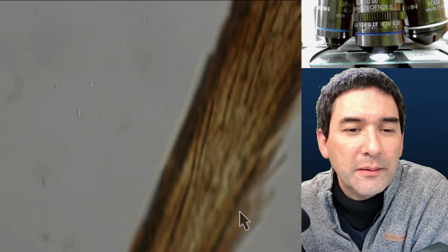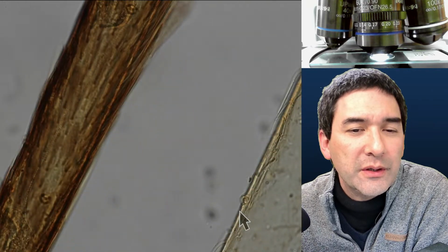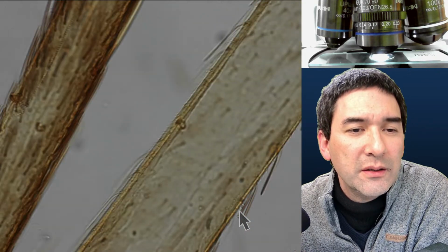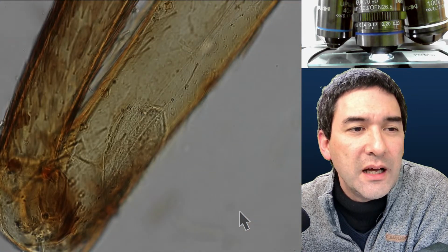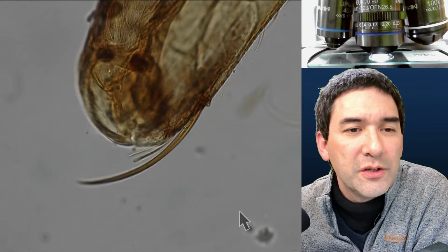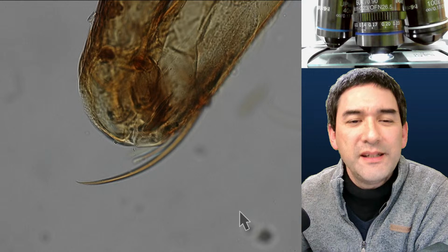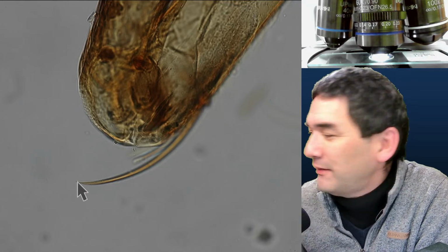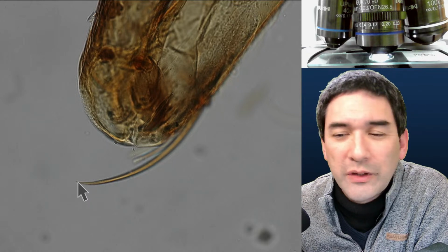And you know what? I think I do have to show you. I've also got some other slides as well, maybe one of my favorite ones. Here, look at this. Maybe here is also a spike, but look how pointed it is. I think it is really amazing. Even at this high magnification, I'm using my 60 times, it is really, really pointed.